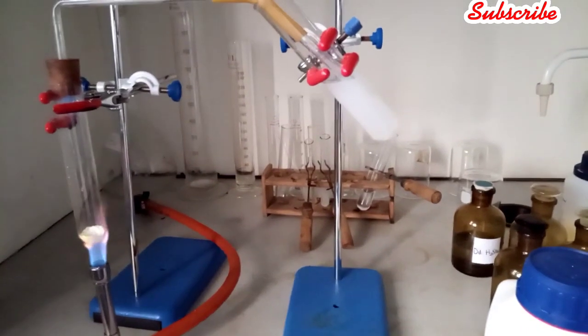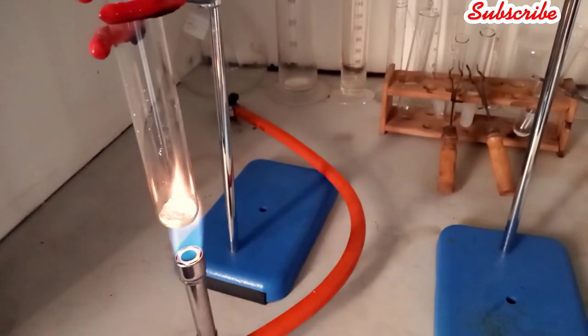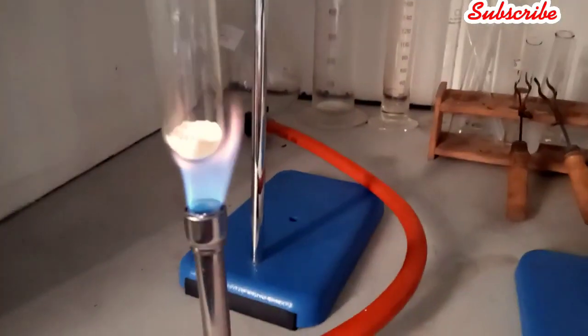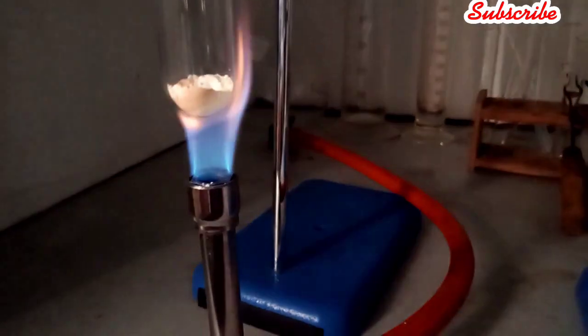Now you can see the lime water has turned milky, and then you observe the salt has turned from white to yellow. You can observe the color of the salt, pale yellow.